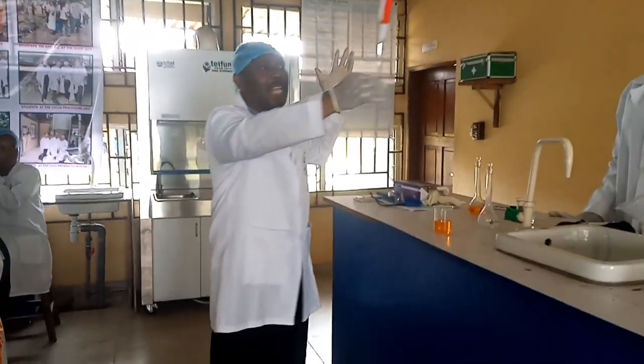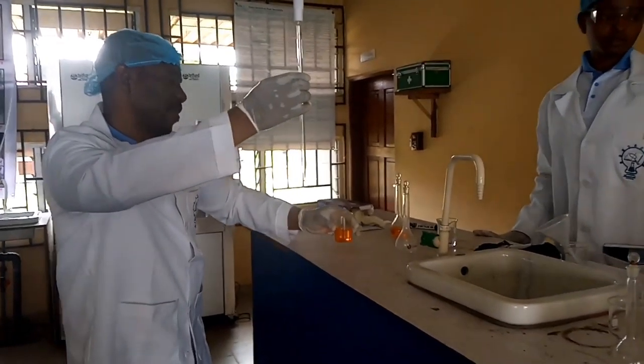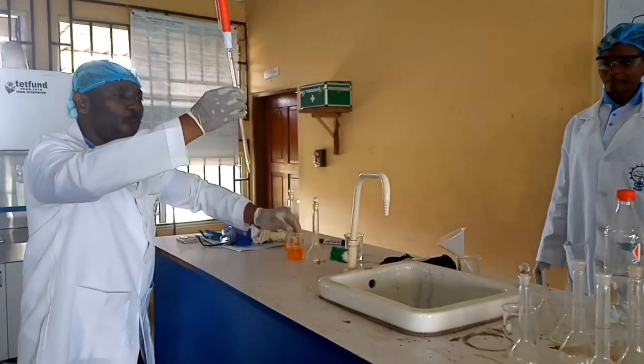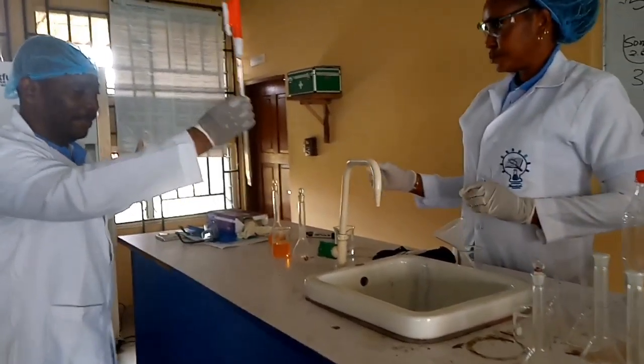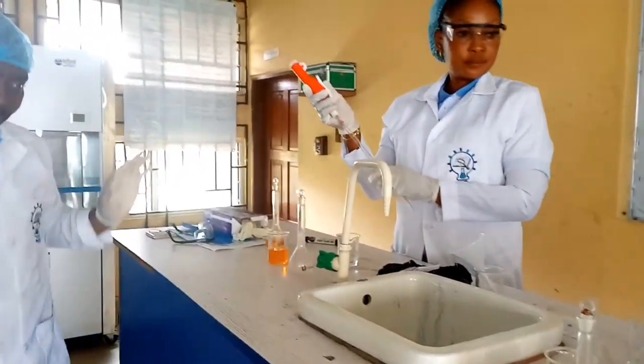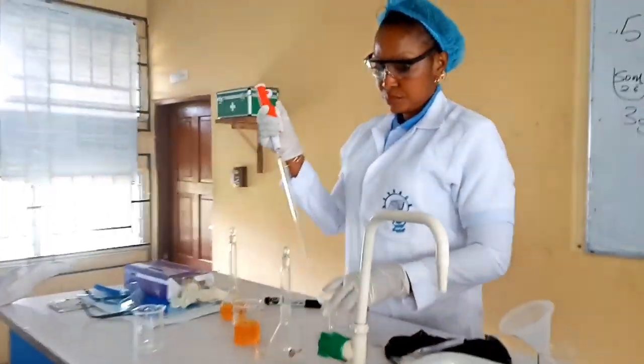Alright? So, we're still going to ask Blessing to help us, or let's ask Judah to help us with this. We need her to take 7 mils from here, or take 10 mils and put here.